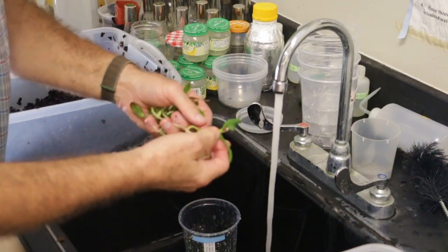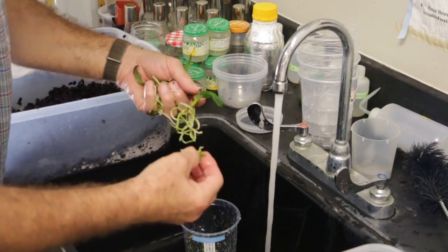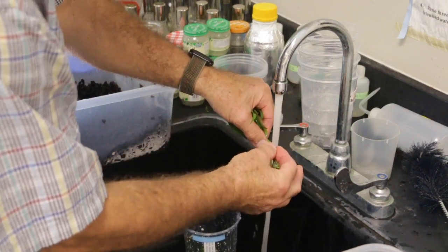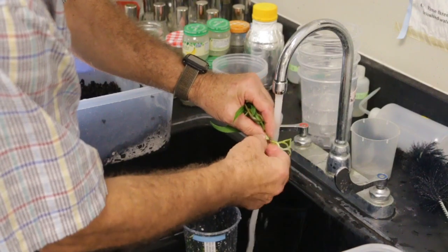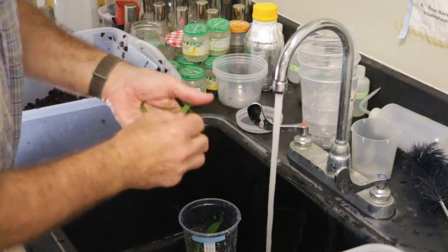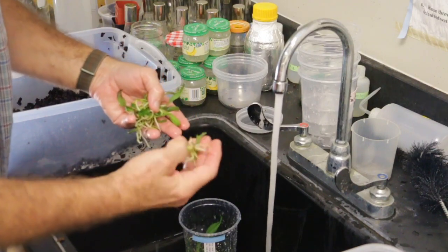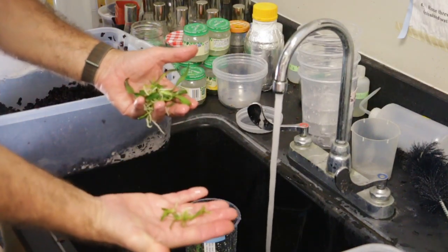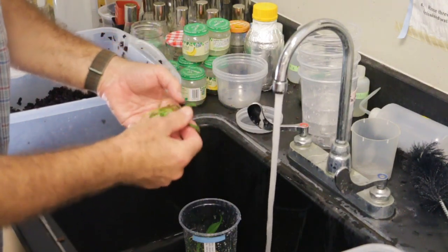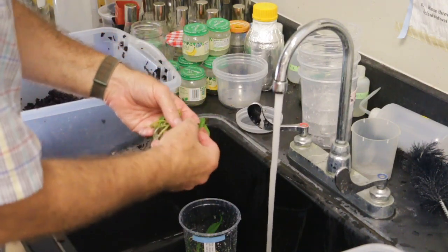There are a lot of small plants in here that I am just not going to mess with. That's the other thing that I found out: you pay a lot of money or not for these flasks, and you want to keep everything. So you've got a lot of small ones here, and what I found out is it's just not worth it. They just struggle, and so it's not worth it.